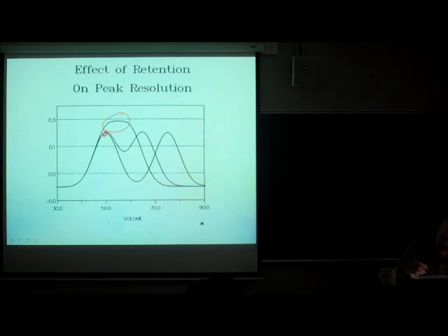You're then going to see this situation. You're going to have somewhat of a valley develop between them. You'll be able to see two peak maxima. The maxima may or may not be really, really close to where the maxima would be if they were perfectly well isolated peaks. If they were really narrow peaks, for instance.